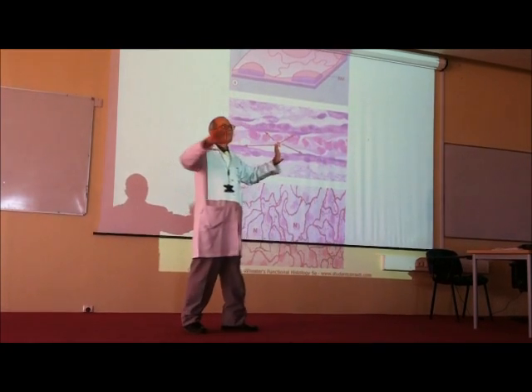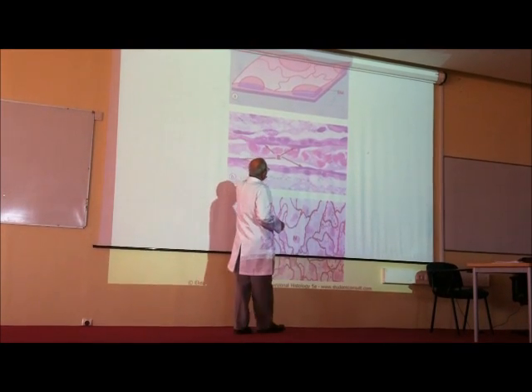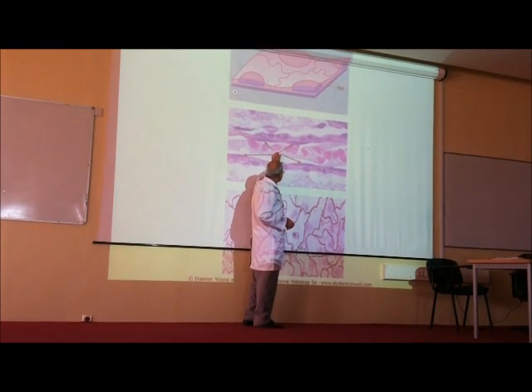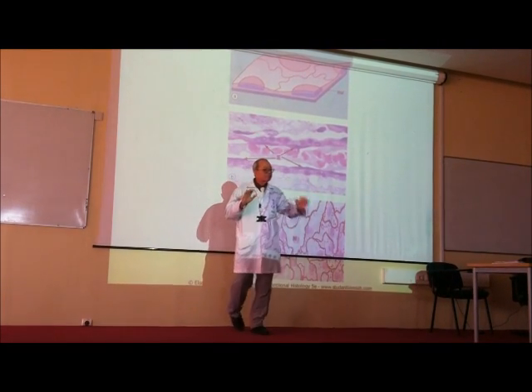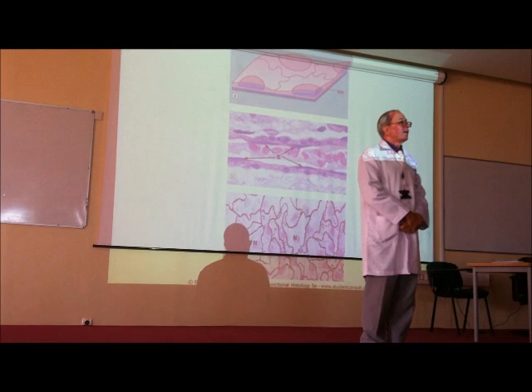I will say the epithelium only. I will tell you about the epithelium. Okay. You will get numbers, not letters, because I will change the arrows. So, what is the type of this epithelium? Name simple squamous epithelium. Why?